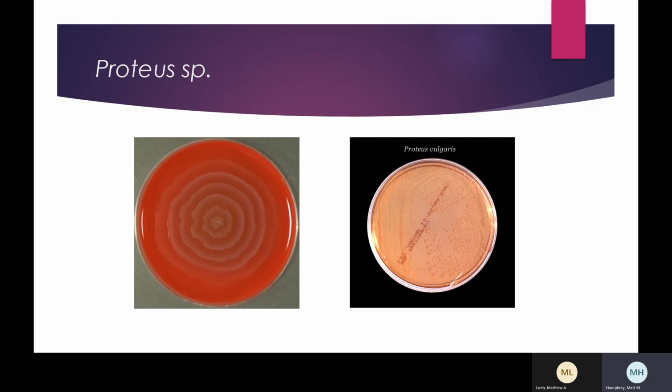Yes. We went over this previously. What is the thing that inhibits Proteus? Pseudomonas can do it. I want to say staph. Oh, you're talking about the agar? It's like the specific chemical or protein that's in an agar, the PEA. Mhm. It's just alcohol. Alcohol will inhibit Proteus. But this is the most common case. There are Proteus that exist that don't actually swarm like this, but this is common.